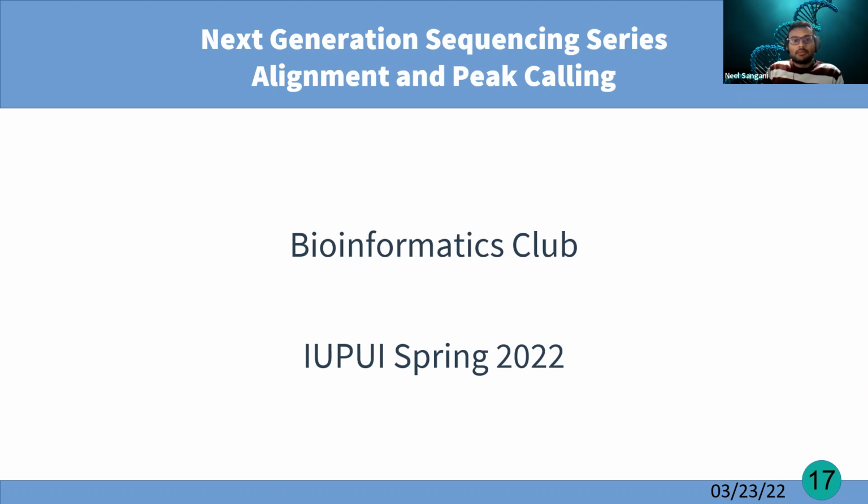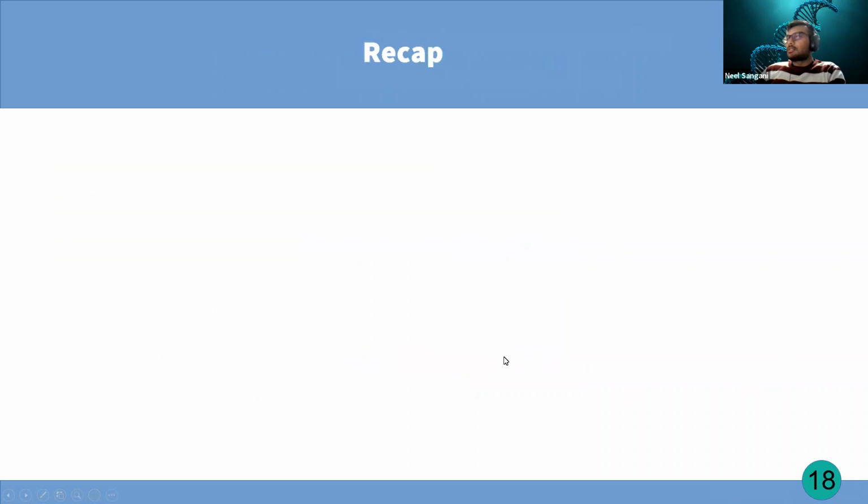For those who have never been to the NGS workshop, I highly recommend that you check out our first NGS workshop, which is also uploaded on the YouTube page. So you'll get an idea of how we got the data and what pre-processing steps we have already done to get to the alignment stage. Yeah, without further ado, let's get into it. So I will quickly talk about the alignment and peak calling for this workshop. So go to the next slide.